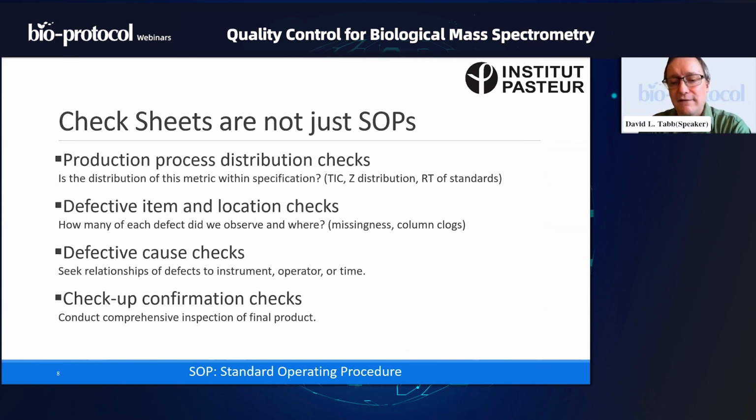Okay, now I've done something very vile with the title of this slide. Check sheets are not just SOPs. SOP is a concept that becomes very familiar to many people in many core lab facilities, but I'm not sure that a lot of graduate students actually get a lot of exposure to this term. An SOP is a standard operating procedure.